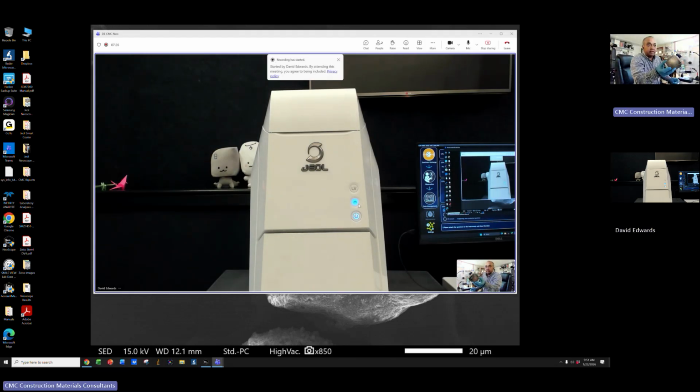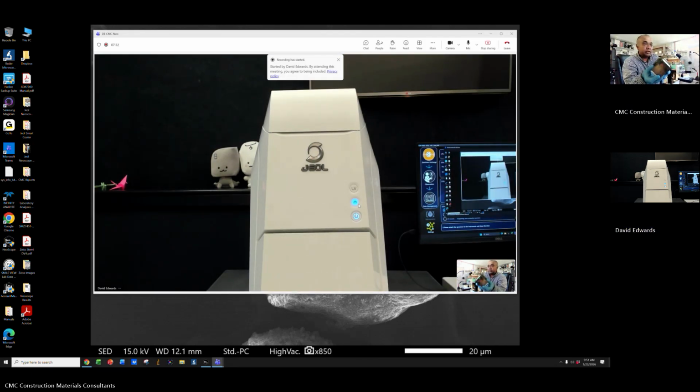Yes, there are some circles I made on the sample. Those are the circles I intended to see in the navigation image. Those are the only areas I want to go instead of wandering around in the whole sample. So I'm trying to figure out if that image is just a reflection or if it's something else.